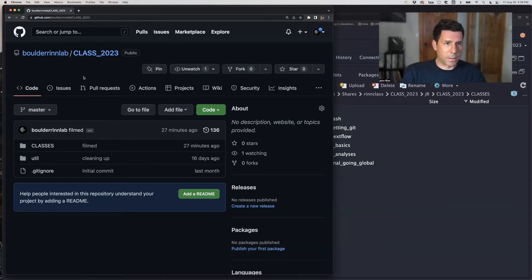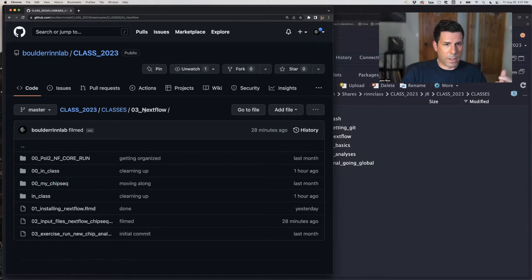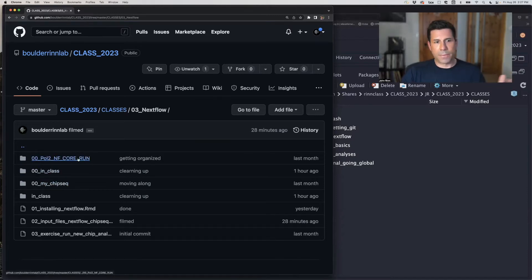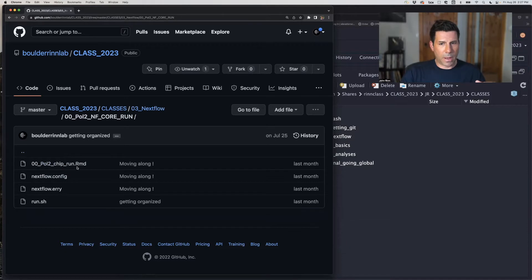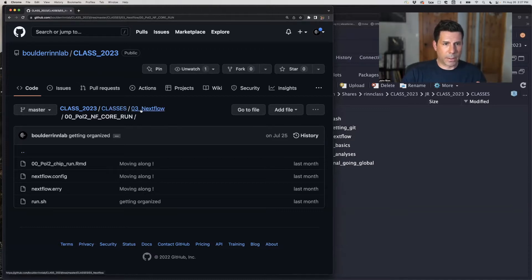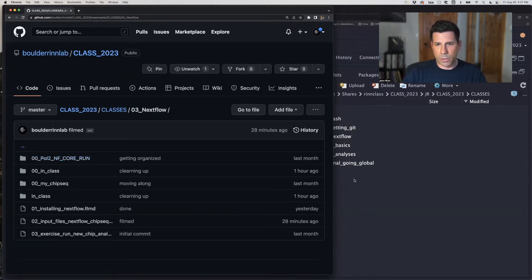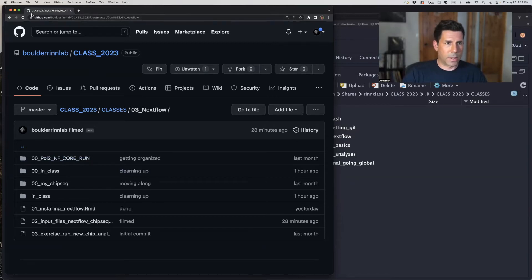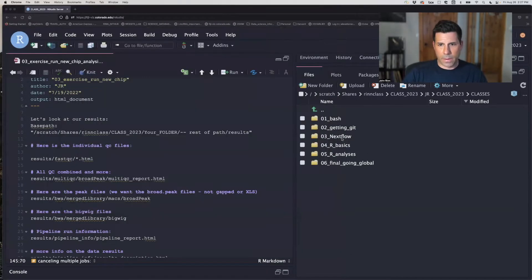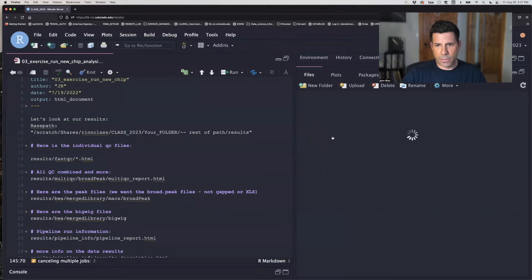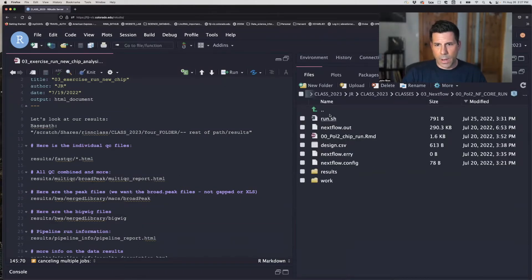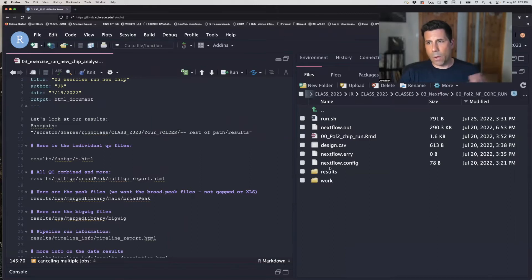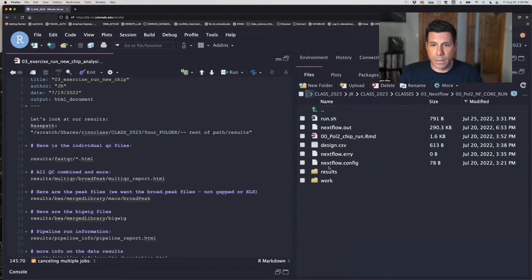So we're here in class 2023 on your GitHub. I'm on mine here, and we're in 03 Nextflow. And we just ran our first ChipSeq in the last class, and now if we go in here, this is where we're going to look and we'll have all of our results in here. This isn't going to show up on your GitHub because it shouldn't be tracked because we've changed our gitignore as such.